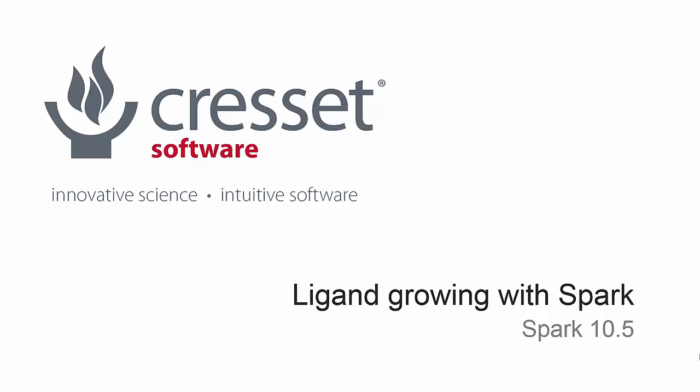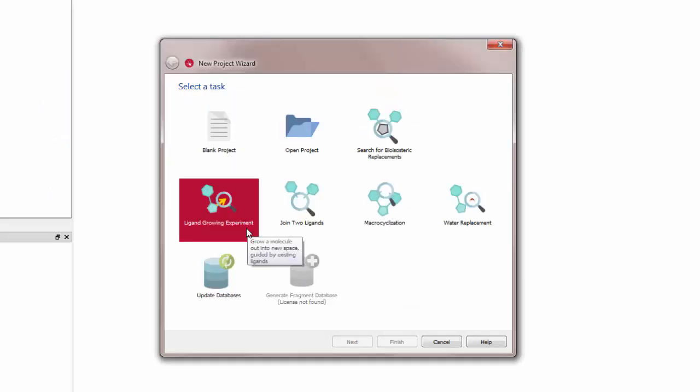In this video I will show how to use Spark to grow a starter molecule into a new space guided by existing ligands mapping a different region of the same active site. In the Spark wizard I will choose the ligand growing option to guide me through the experiment setup.